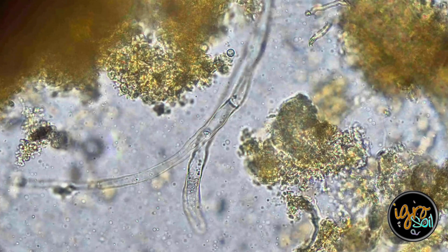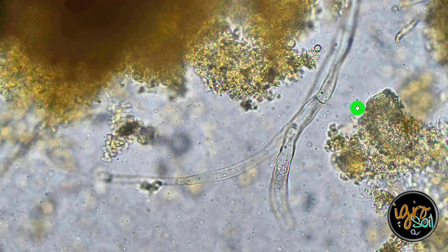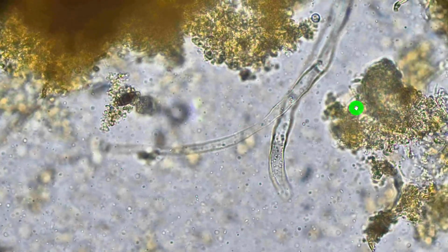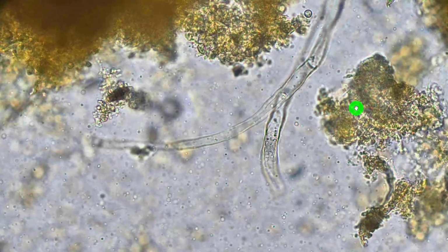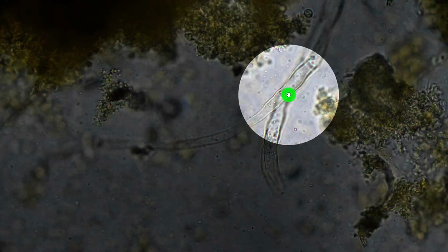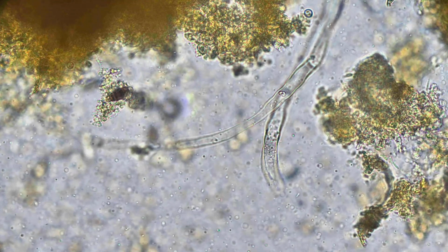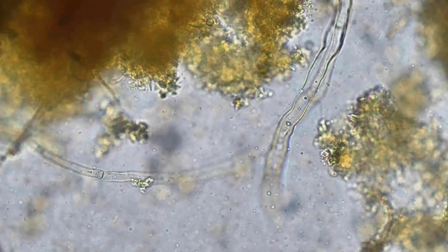Now look at this. So here we're looking at septa, right? That's a clear septa. It may be too thick to be an actinobacteria, but look inside of it. It's got bacteria in there. So the question is, does it eat bacteria? Yes, it absolutely does. Look up here, right? Look here. And I'm taught by Matt Powers, my instructor, that if it has bacteria in it, then it's not a pathogenic type of fungi. So that's a great indicator when you're looking at something that you do not recognize.